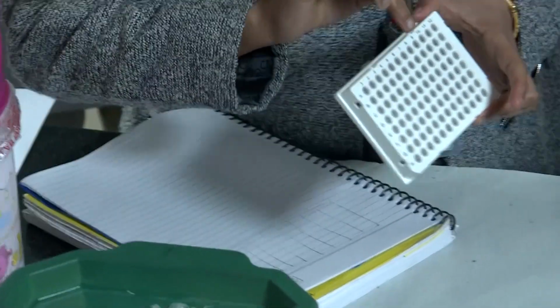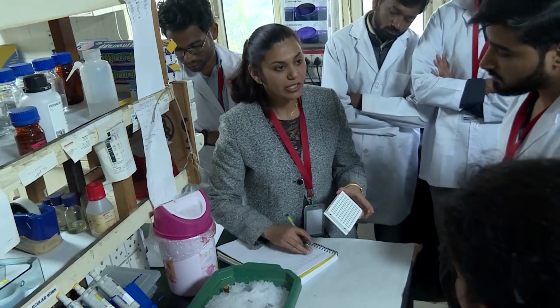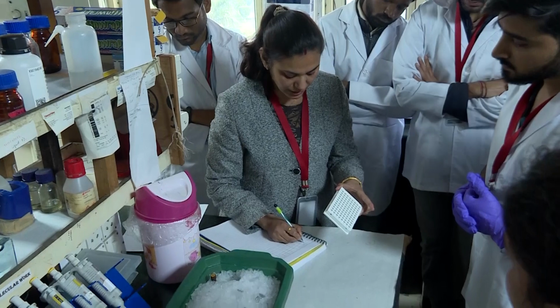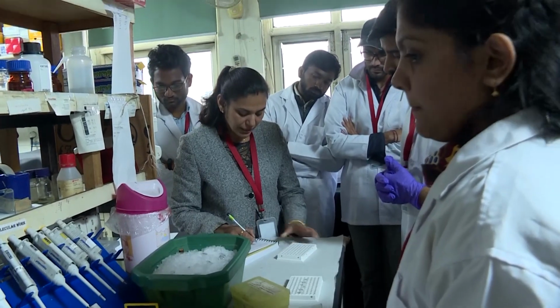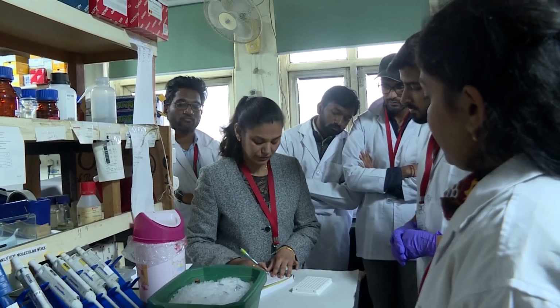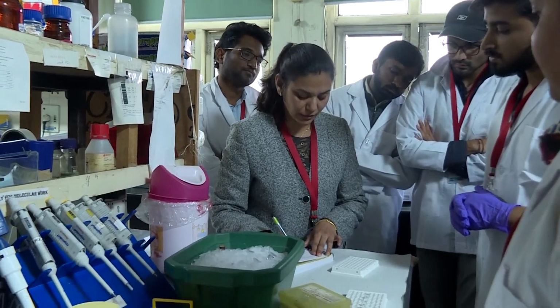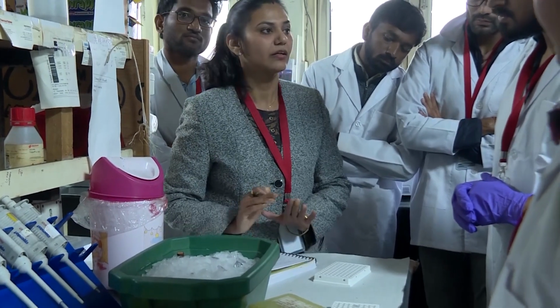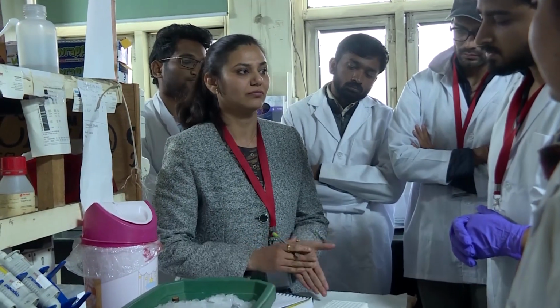There are 12 columns and 8 rows. The same plate we have made here. Here it is written 1, 2, 3, 4, and here A, B, C, D, E, F, G, H. Now suppose we are going to add here control gene, then heat stress gene, heat stress gene, then control actin, heat stress actin, heat stress actin. So if I forget, we still have a record and can trace our data.